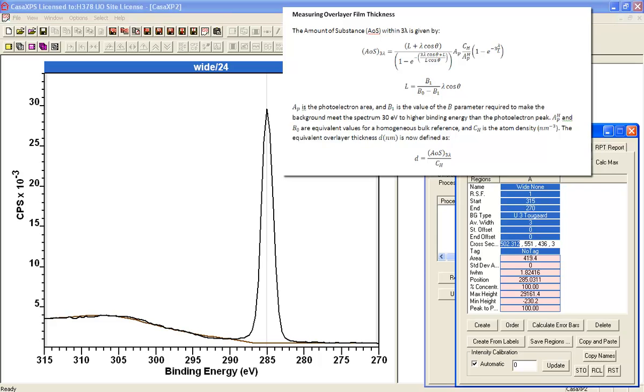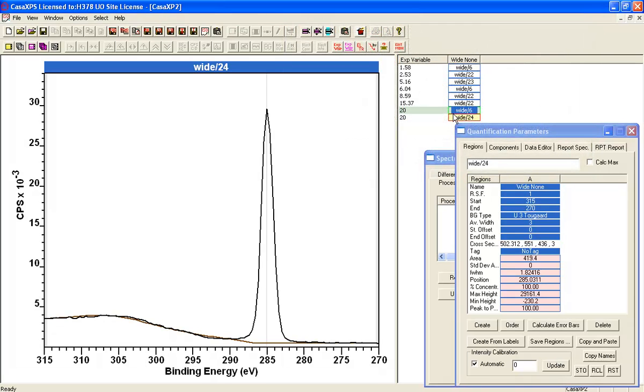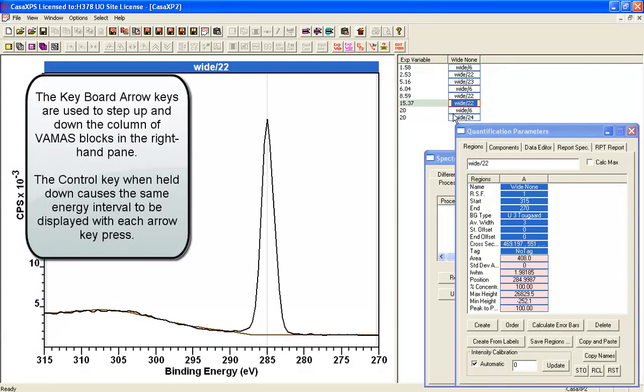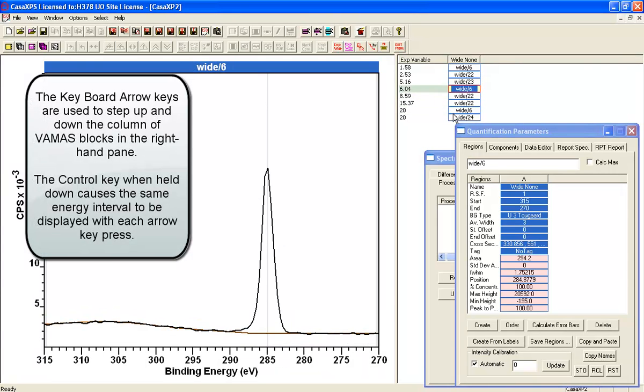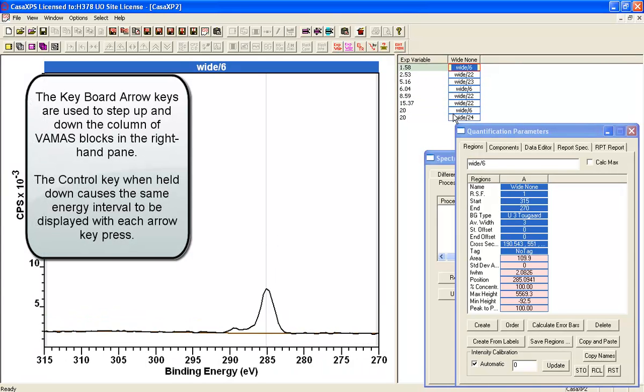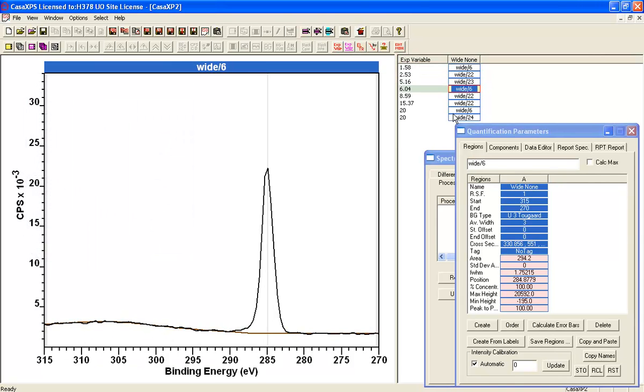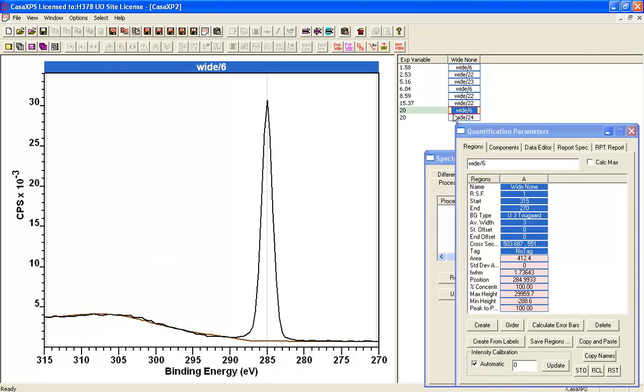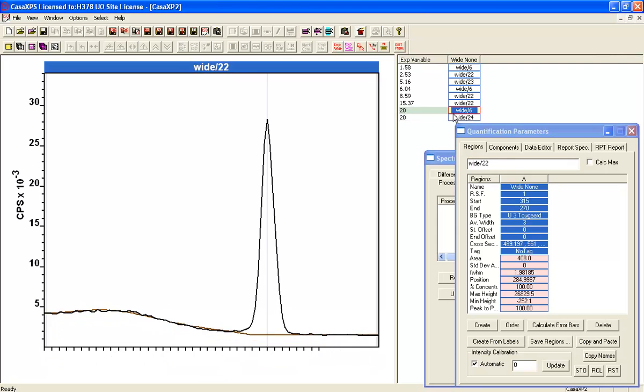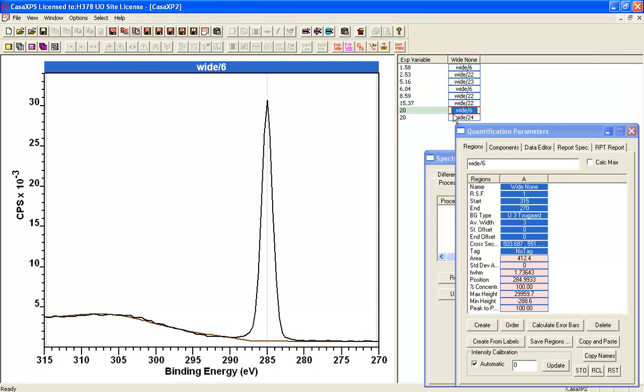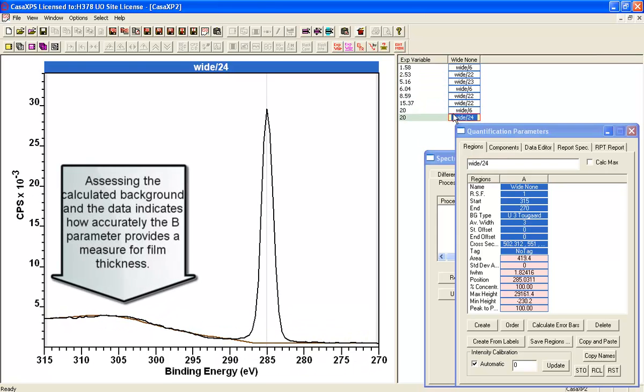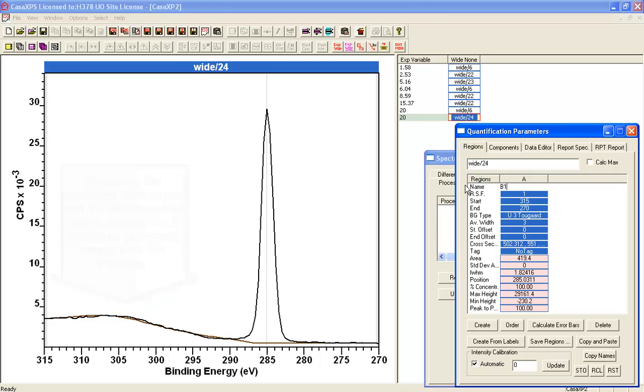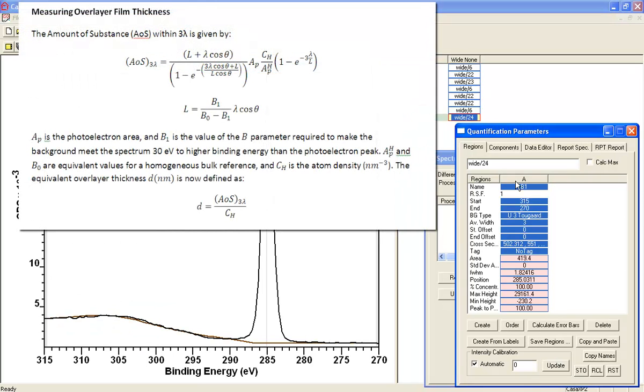Let's just step through these. So I'm holding the control key down so I can maintain the interval. And I can now have a look and see that to a reasonable approximation, the background is fitting nicely to these data.